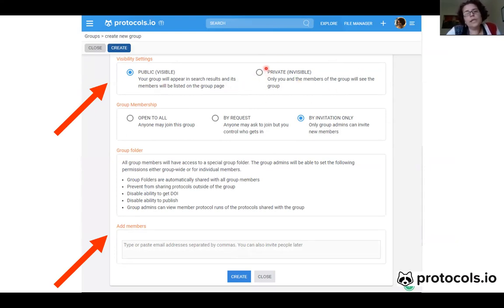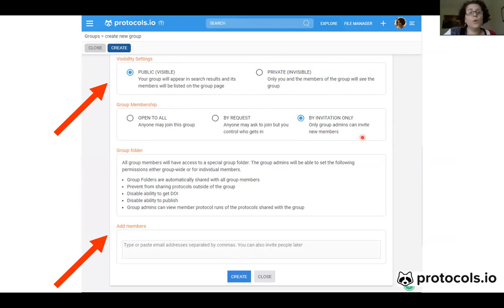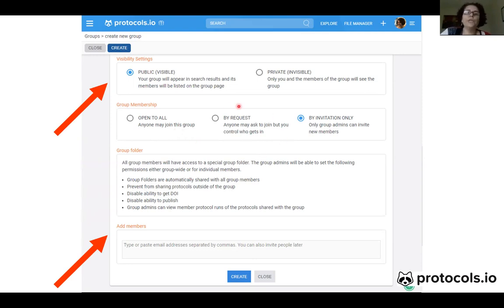Once you click on private, the only way that members can join your group is by invitation only. That means no one can see your group — it's not open, no one can join it, and no one can request to join the group because they cannot see it.